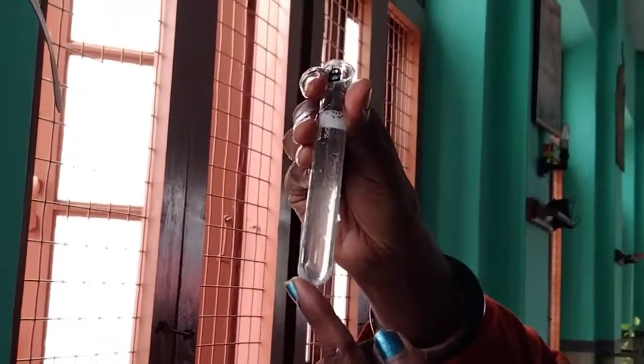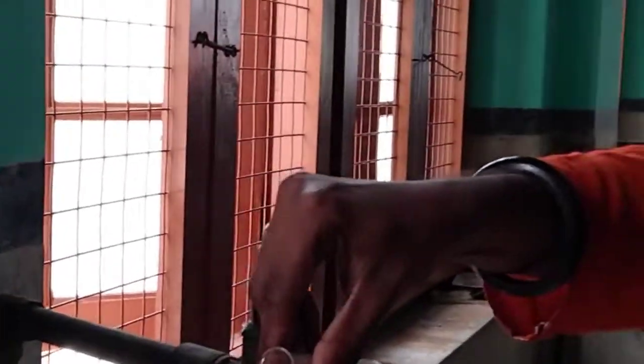You can see the scales settling at the bottom. Can you see the scales settling at the bottom? Those are scales settled at the bottom. You can strain this slowly.